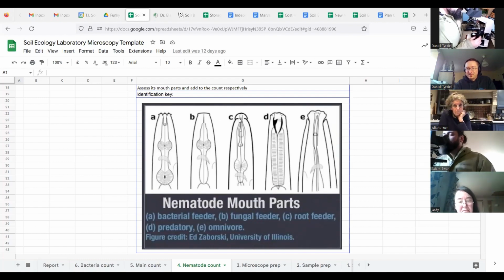There is also, to add to the confusion, a predatory nematode that feeds on fungal feeding nematodes that actually has that kind of spear as well. But in general, we look at general morphology. The little spear basically gives you an indication that it consumes fungi. It gets up to the size of fungi, almost kisses the hyphae, punctures it, and sucks out the inside fluids.